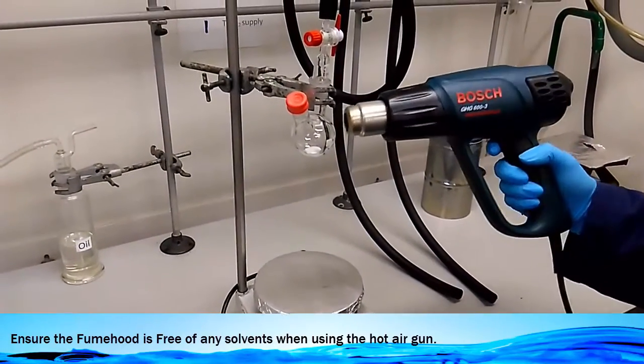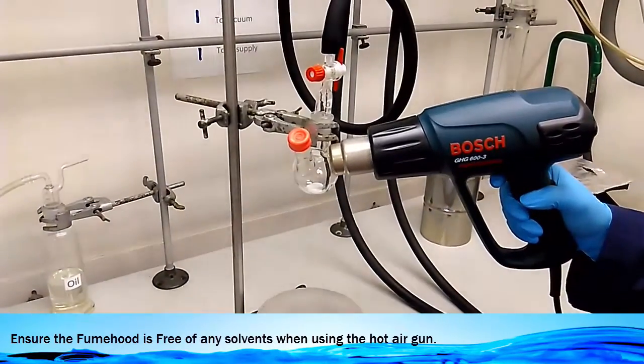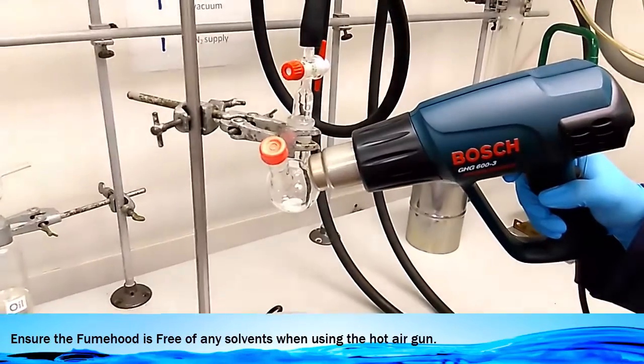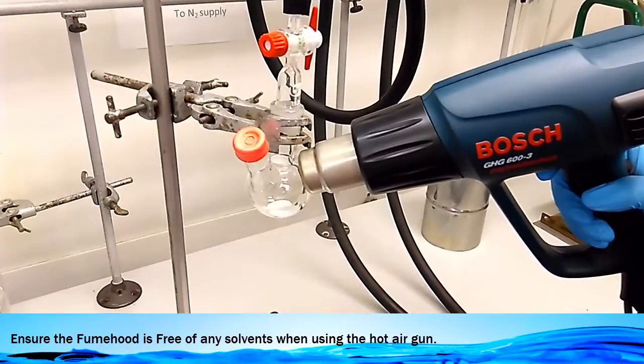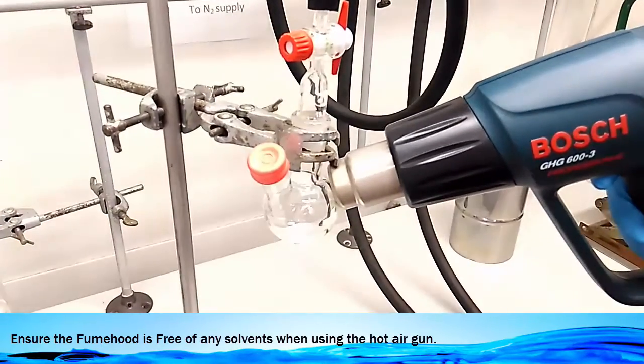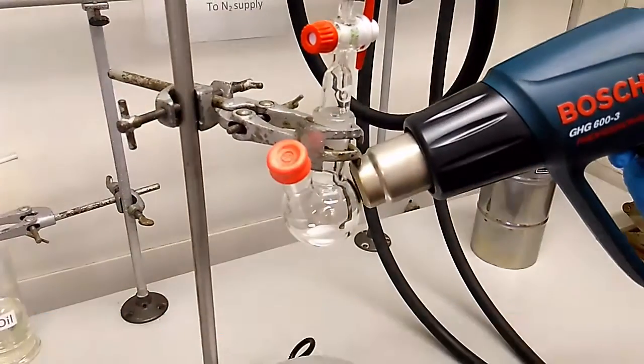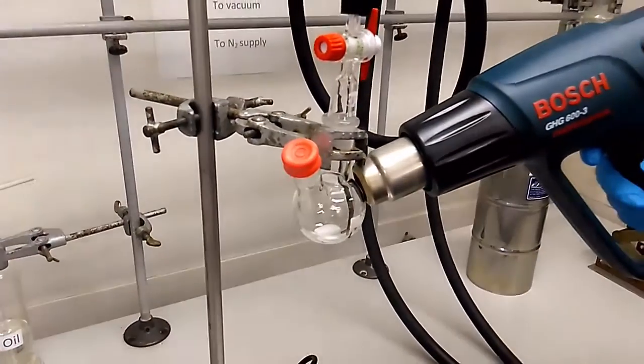Make sure that the fume hood is empty before you can do any heating. Especially there should be no solvents inside the same fume hood. Slowly aim the barrel of the gun to the base of the RBF to the side and you point to the same side for some time.